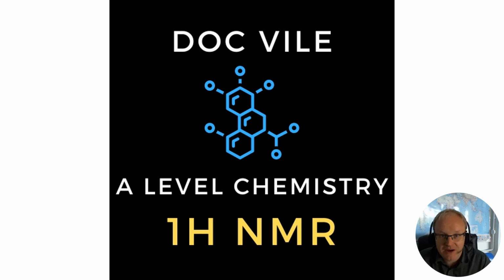So what information can we get from a hydrogen NMR? It's only going to be an introduction, I'd have thought, in this video, looking at some nice simple molecules. I'll come back perhaps in a separate video and look at some more challenging problems, and I'll also do other videos on carbon NMR as well as looking at things like mass spec and infrared, but we're just going to focus on hydrogen NMR in this video.